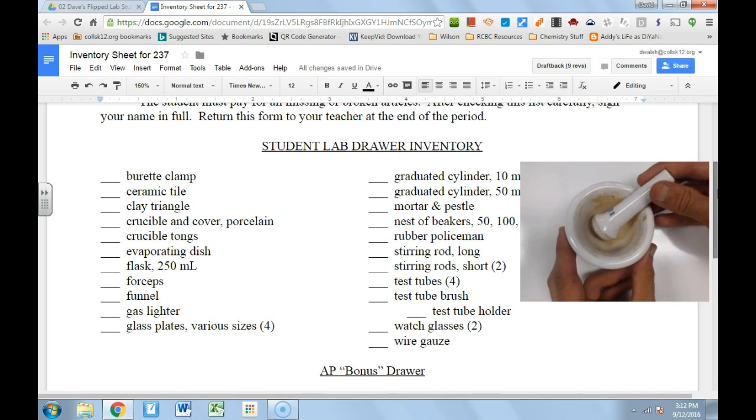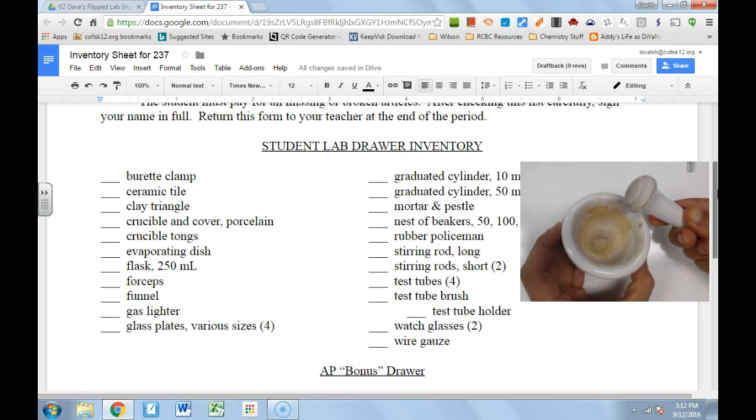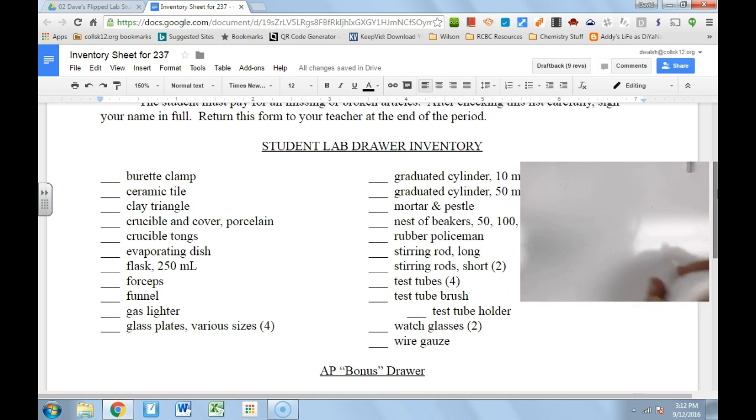We have our wonderful mortar and pestle — one of my favorite pieces of labware. If you want to crush something up, you have two hard pieces of ceramic, and by mashing them together you can pulverize all sorts of substances into fine powders.